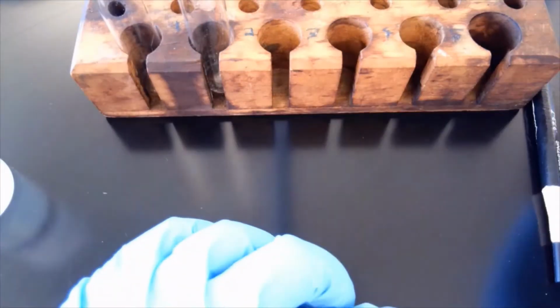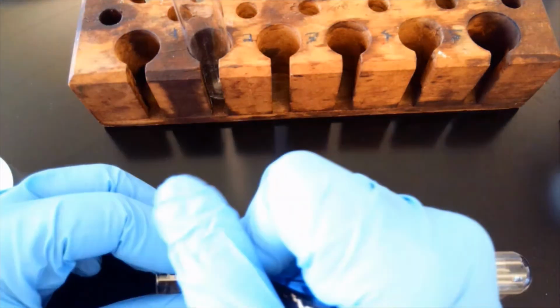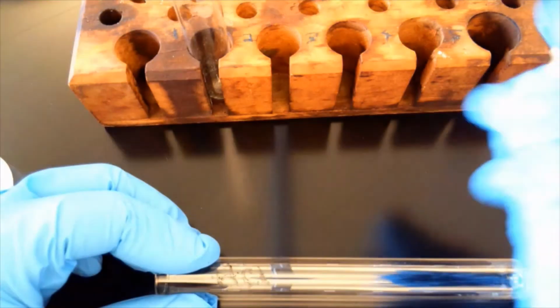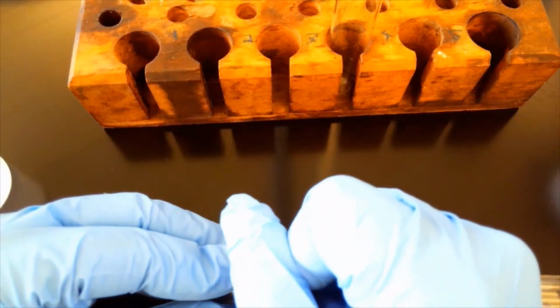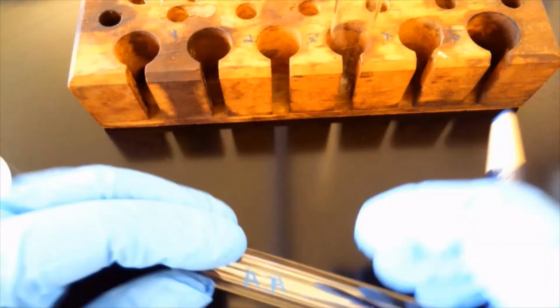So what we're going to do is use 2 test tubes. First off, we want to mark what they are. So I'm going to write HCl for our first one, so we know what we're comparing. And on my second one, I will mark my acetic acid, which I'm just going to call AA for acetic acid. So I have acetic acid and I have HCl.